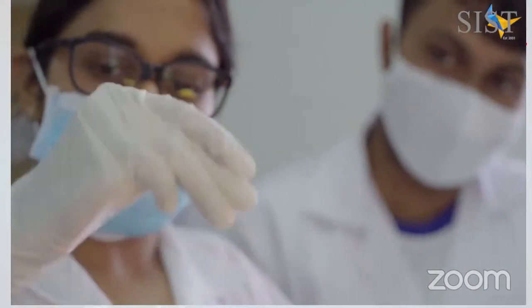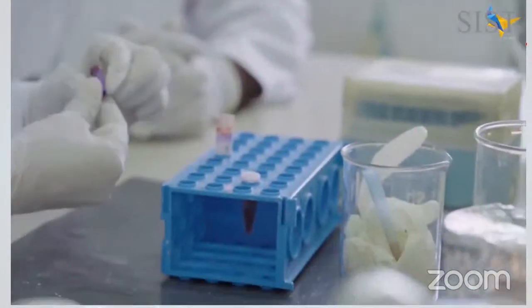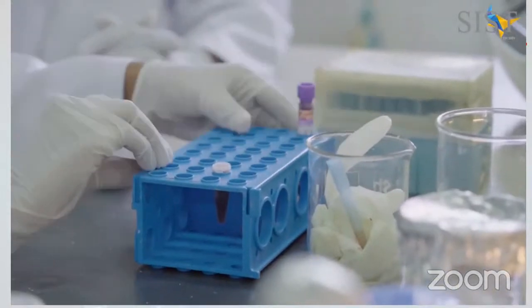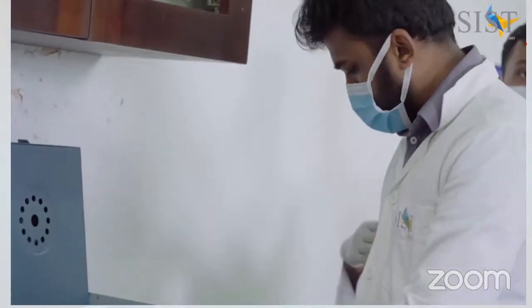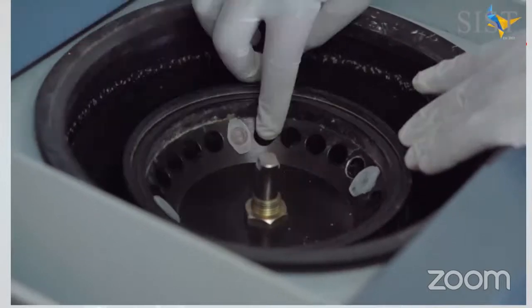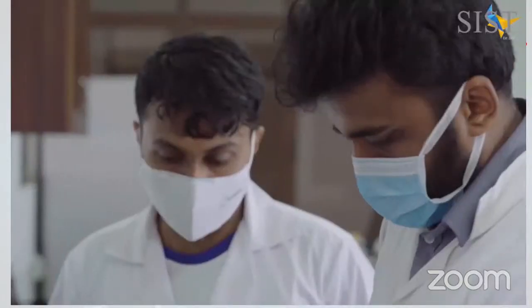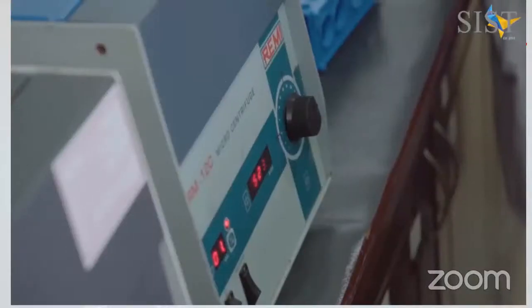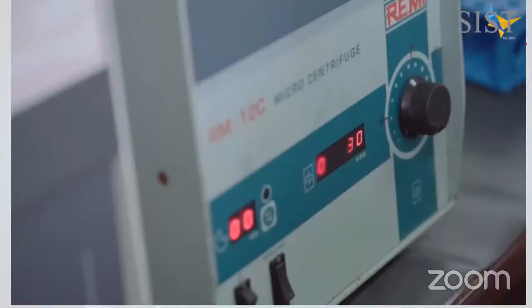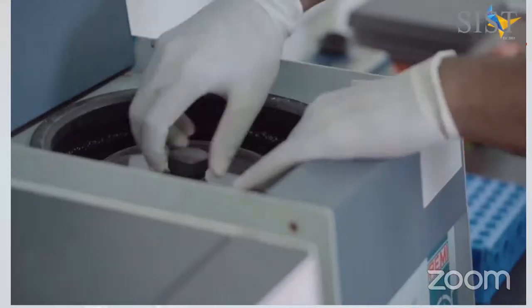Once the contents are very well mixed, this content should be centrifuged as per the given protocol. The centrifugation takes place inside a microcentrifuge machine. When inserting the tubes, it's important that you balance the wells so that you can ensure maximum efficiency in the centrifugation procedure. It will also make sure that the instrument is not damaged during the centrifugation procedure. Upon completion of the centrifugation step, you can take off your microcentrifuge tube.